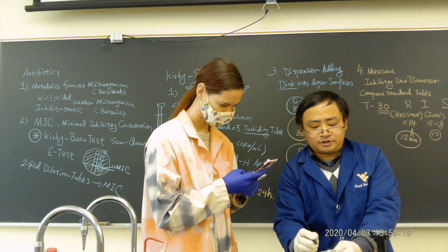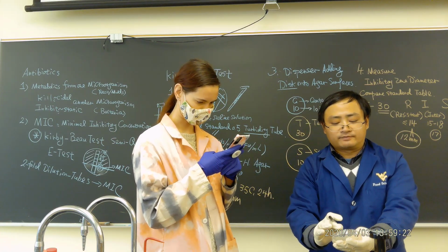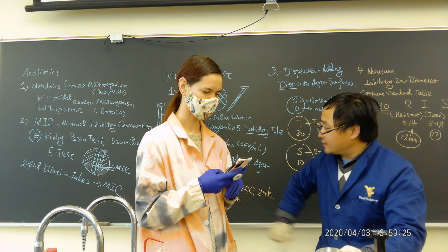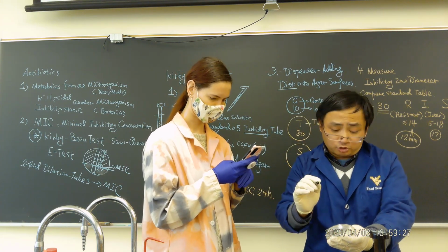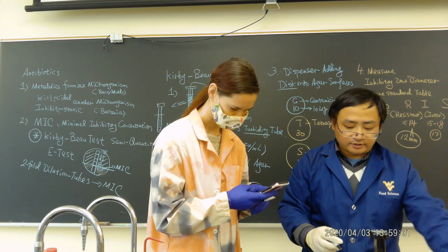Now I want you to put the label on the side or write a little bit small, because otherwise if you label too much, that zone will be difficult to see. Okay, so let me do that. Okay, yeah, that's after label.